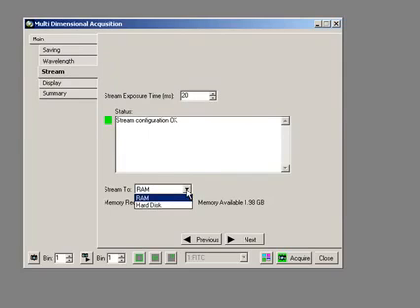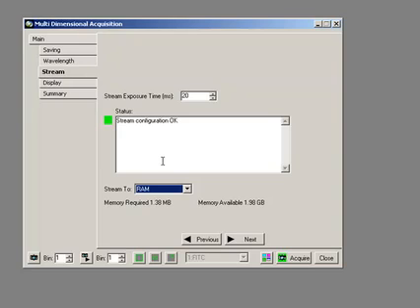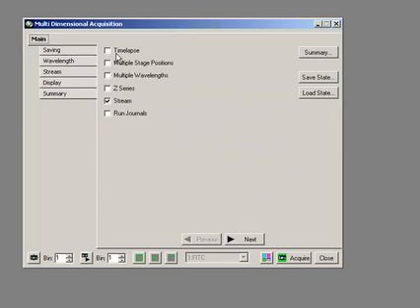Take all this information to either RAM or to the hard disk. I'll just stick with RAM for the moment, but effectively we haven't chosen a parameter stream. So let's stream timelapse.